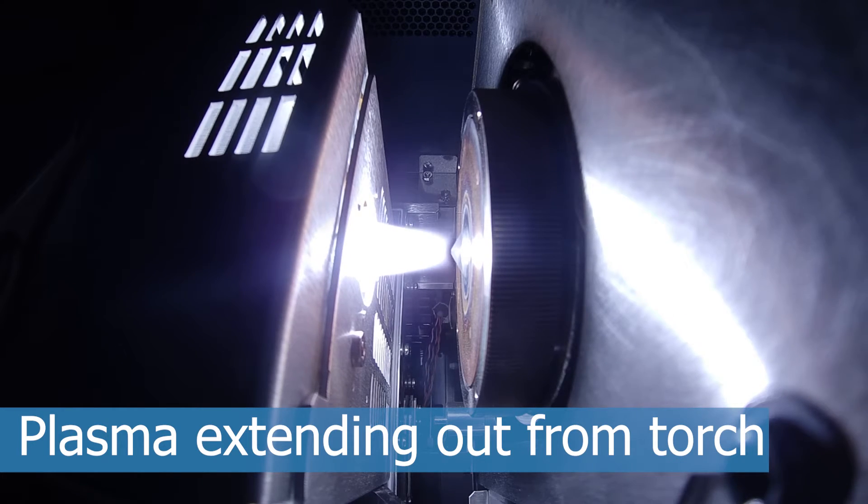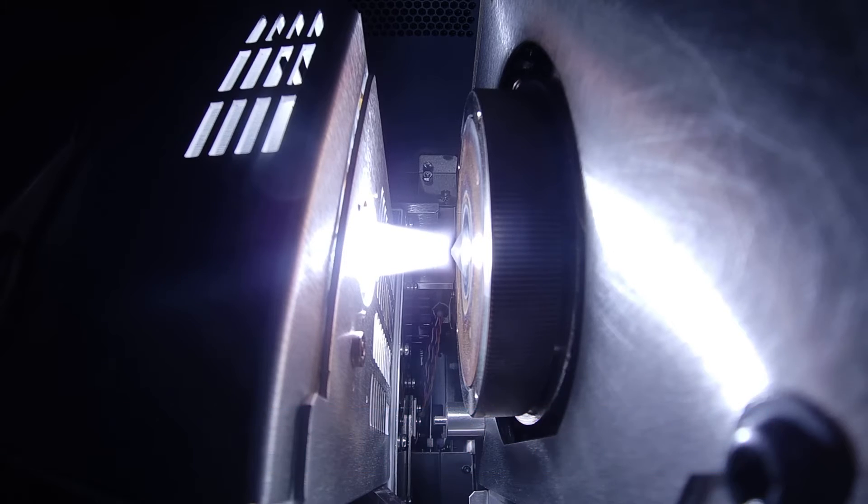Collision with other argon atoms ionizes them, sustaining the plasma. The very high plasma temperature originates from the high power input from the RF coil.